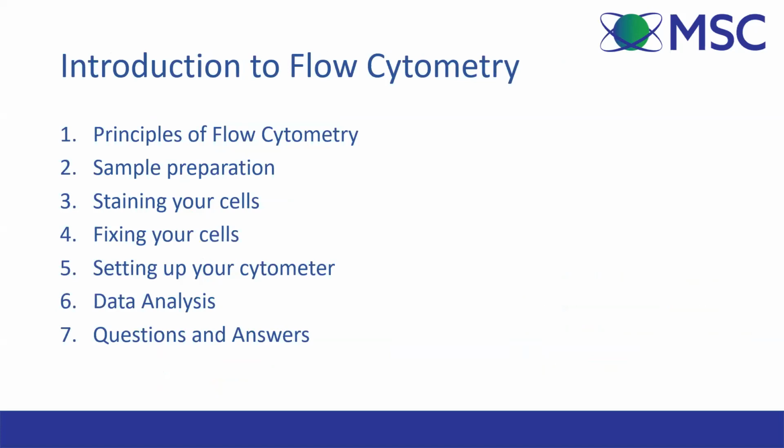So today we'll cover some of the basics of flow cytometry, from the principles of how the technology works, how to prepare your samples, how to stain and fix your cells, how to set up the cytometer for an experiment, data analysis, and finally we'll have a look at some questions and answers at the end.